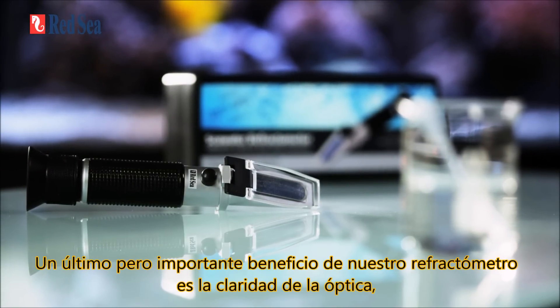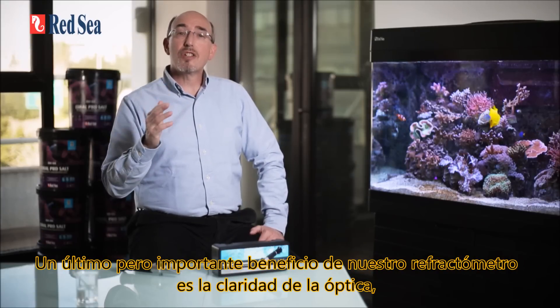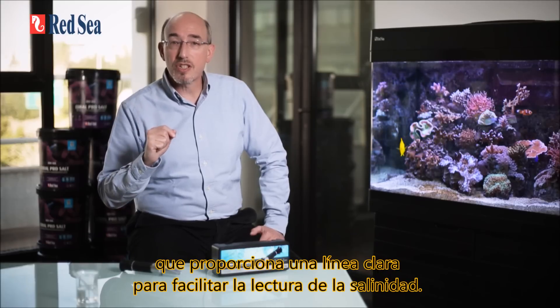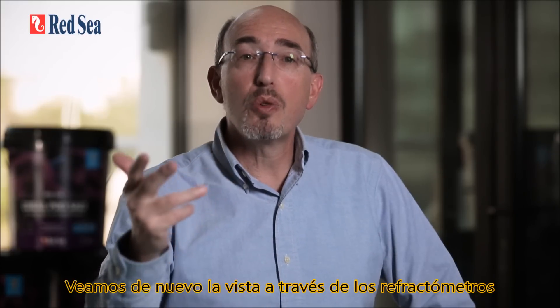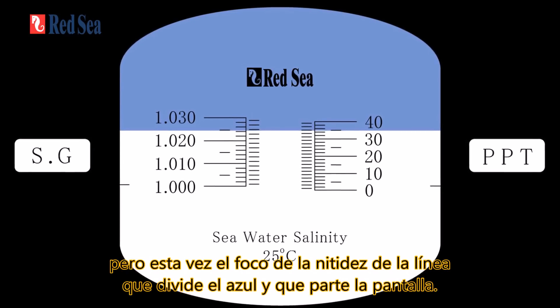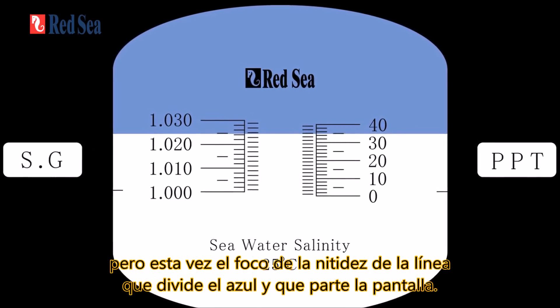One last but important benefit of our refractometer is the clarity of the optics, which gives a sharp line for easy reading of the salinity. Look at the view through the refractometers and focus on the sharpness of the line dividing between the blue and white parts of the screen.